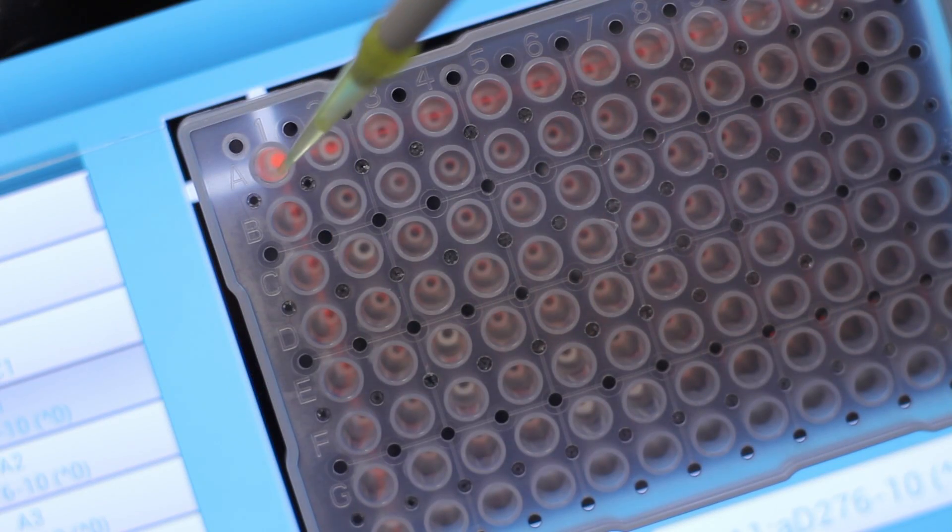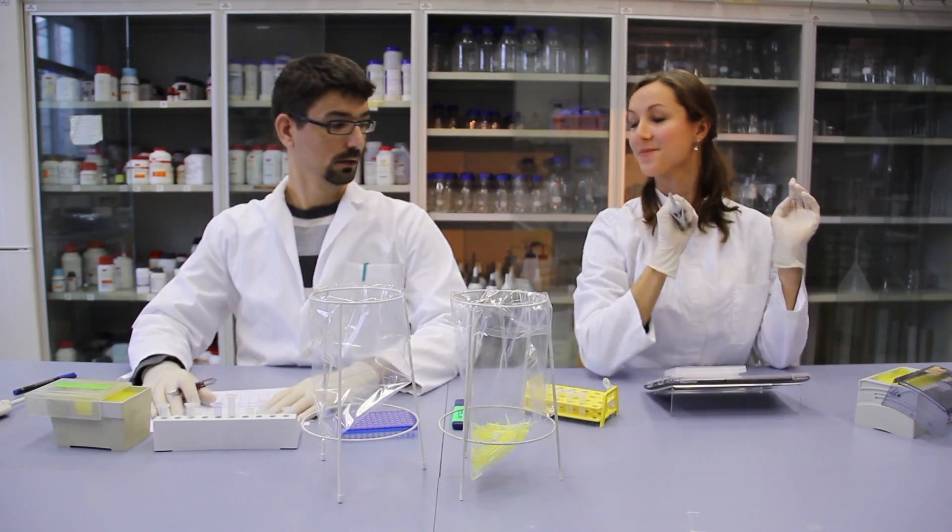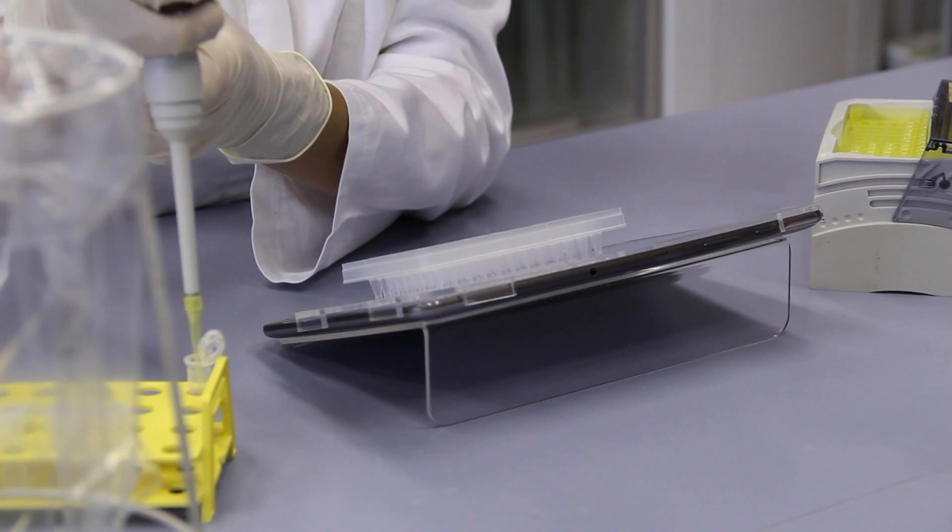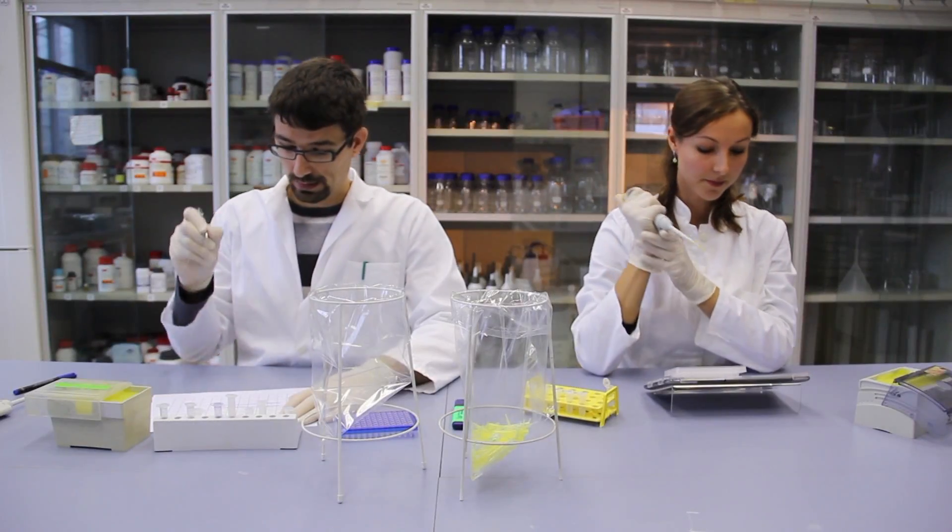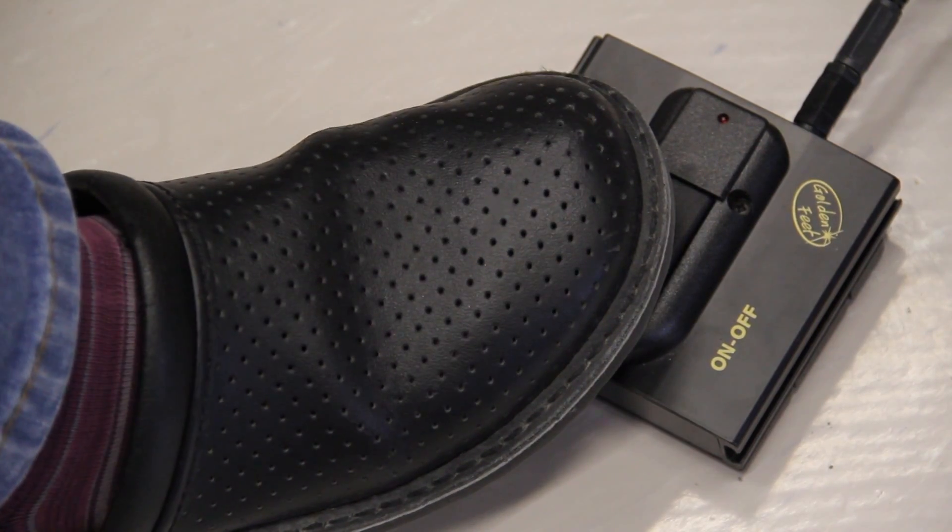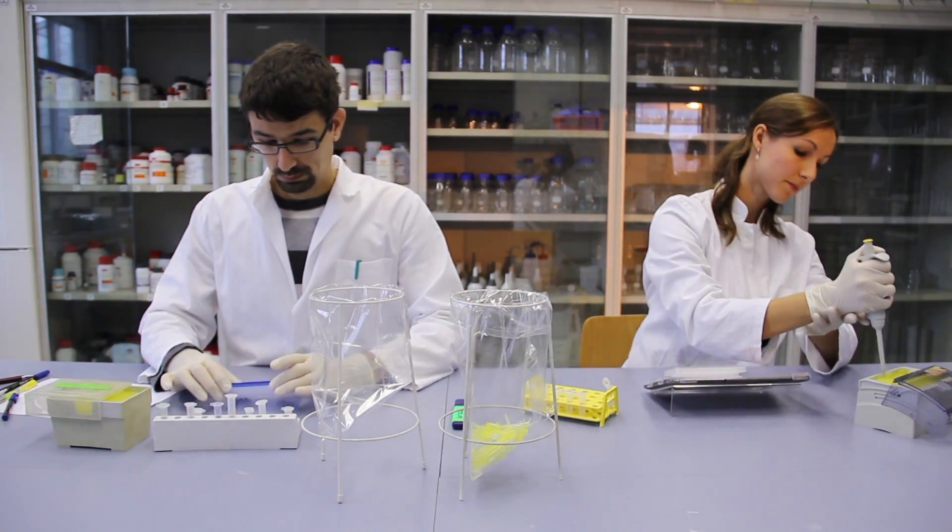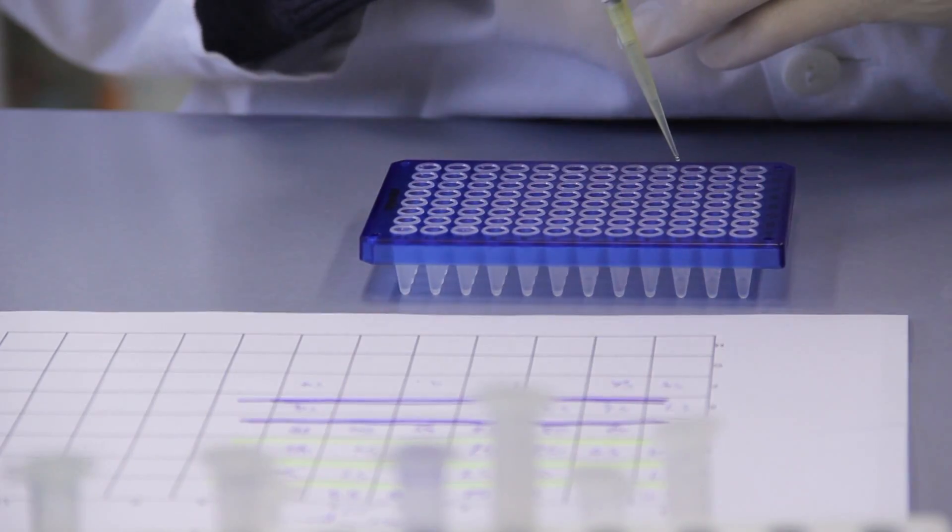During pipetting, a red position light will navigate you through the plate and point out which well the next sample should be placed into according to your pipetting plan. Switching to the next well is easy: you can choose to use the timer, the foot switch, or the next button. No more wondering about where you left off.